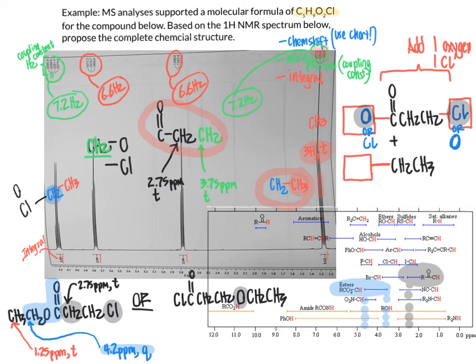triplet. And it's going to be at the relatively downfield end of that range because not only do we have a carbonyl nearby, but at the next position we have an oxygen of that ester. So that's going to make it at the relatively downfield end of that range. So it all works out now. And then we come here to a CH2, and that CH2 is going to be the guy right here. And that shows up in our spectrum at 3.75 ppm as a triplet, exactly as we would expect. And so this structure is going to be a really great match for the data.